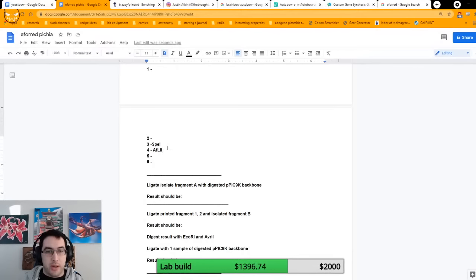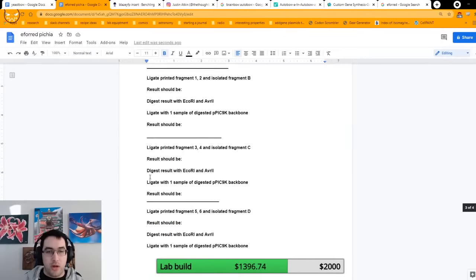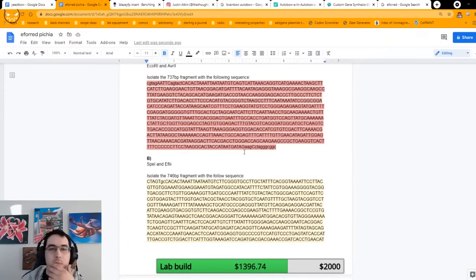Okay, moving on. So we now have SpeI, AflII, which means 3 and 4 should be fragment C, which should be yellow. That's not good. Huh. This is why we check.